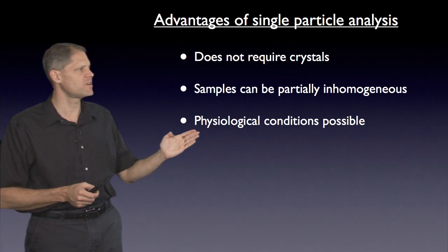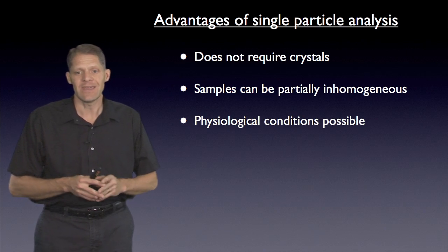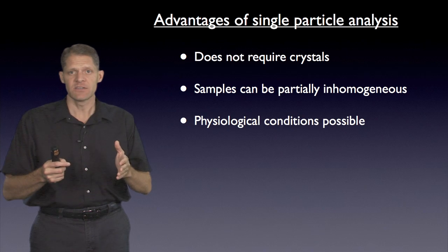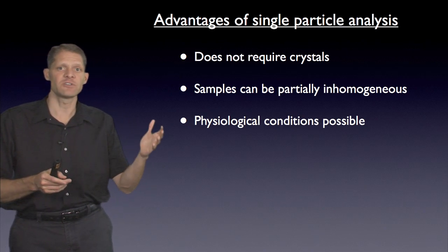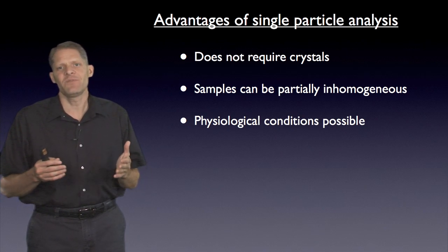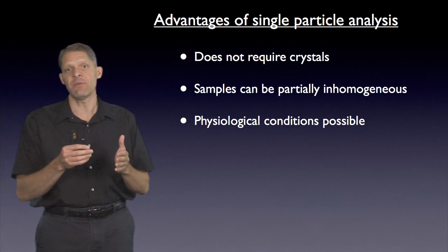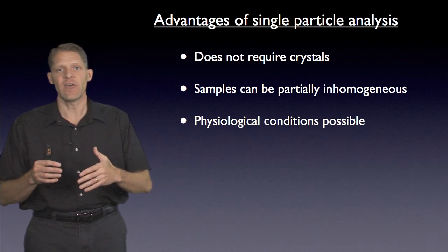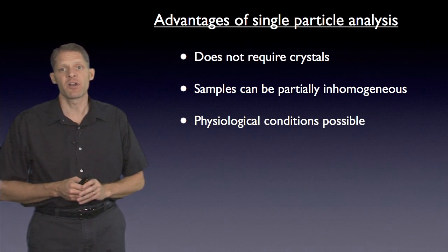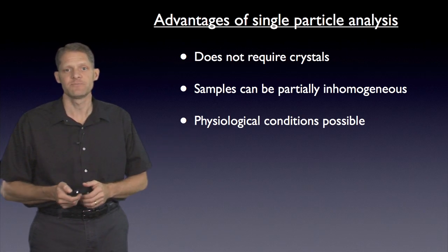Also, physiological conditions are possible. You can take your purified protein of interest in physiologic buffers and plunge freeze it. And that's in contrast to other structural techniques, for instance, X-ray crystallography or NMR spectroscopy, where your sample has to be in non-physiologic conditions, perhaps in order to induce it to crystallize, or maybe to get it to such concentrations that it will give you good signals in NMR spectroscopy. In cryo-EM-based single particle analysis, you can observe your particle in physiological conditions.